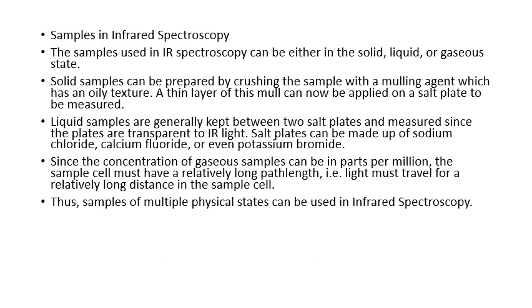Samples in infrared spectroscopy. The samples used in IR spectroscopy can be solid, liquid or gas. A solid sample can be prepared by crushing the sample in a mulling agent which has an oily texture. A thin layer of the mull can then be applied on a salt plate to be measured.